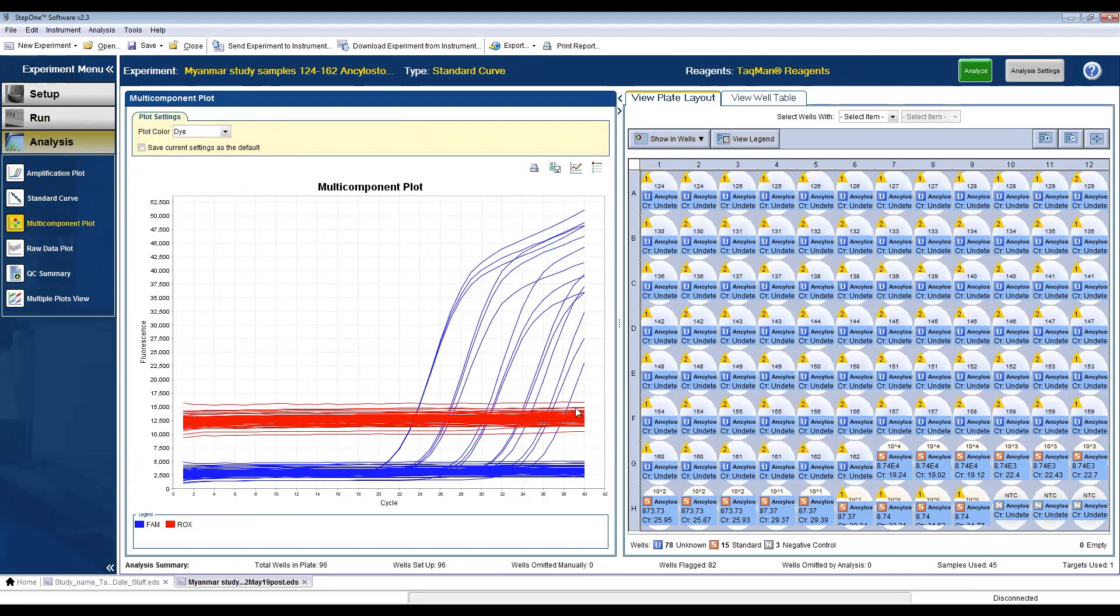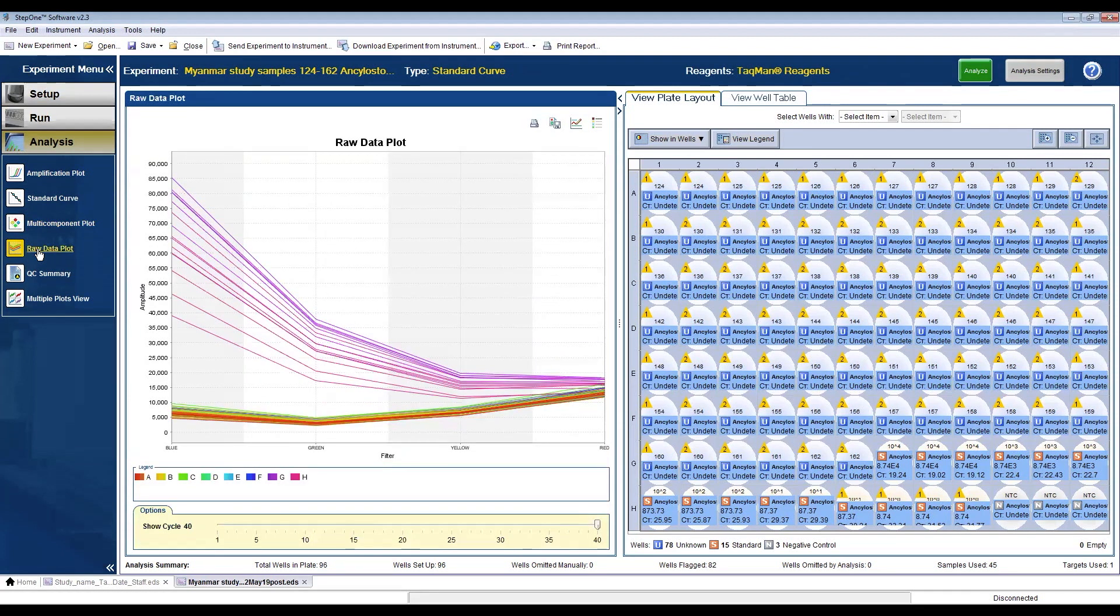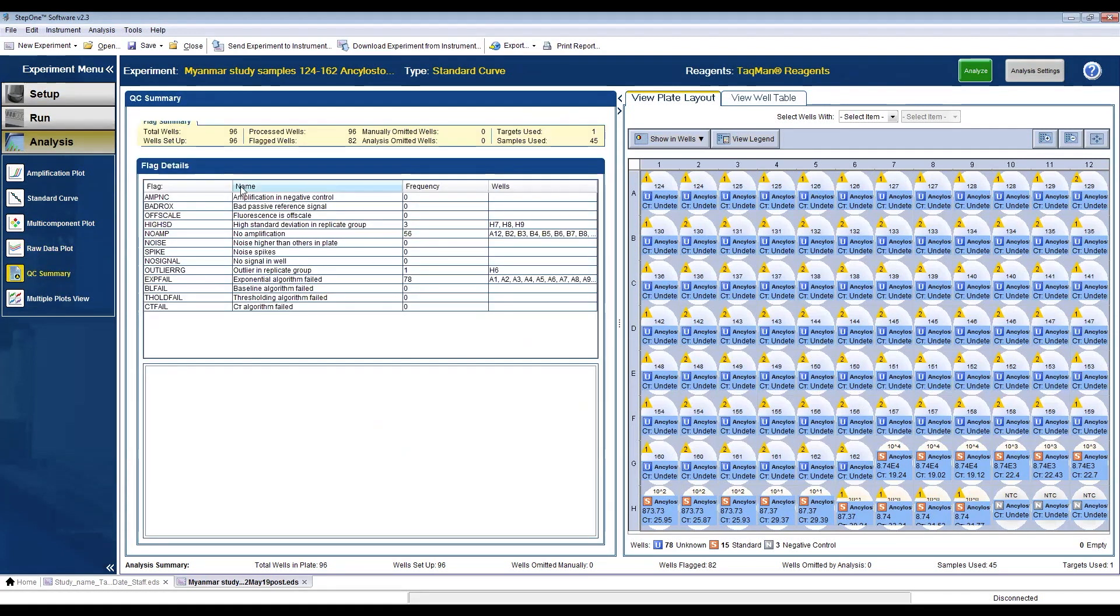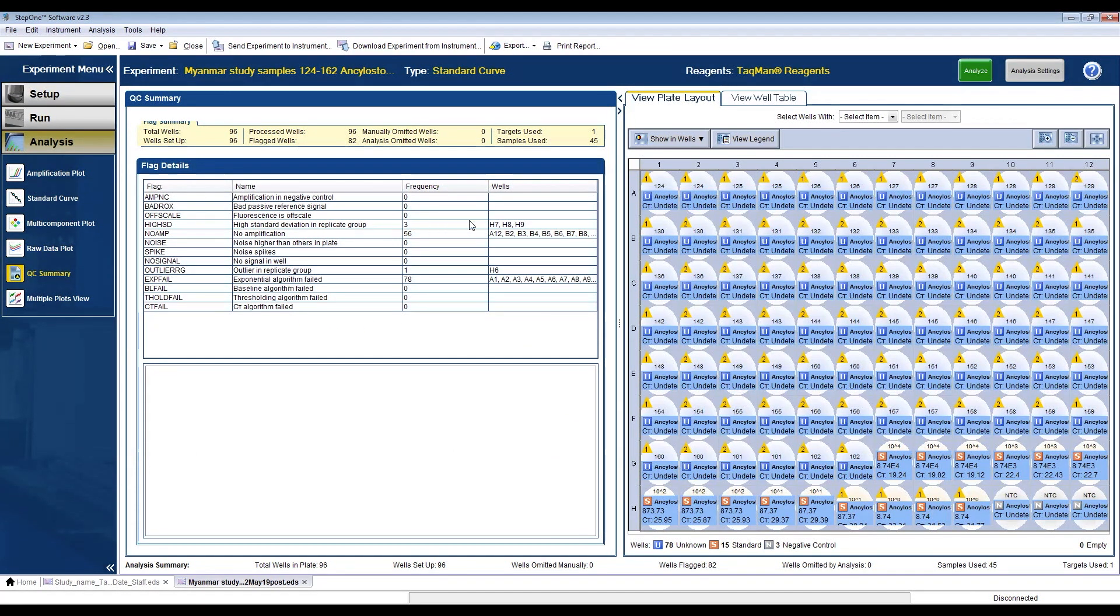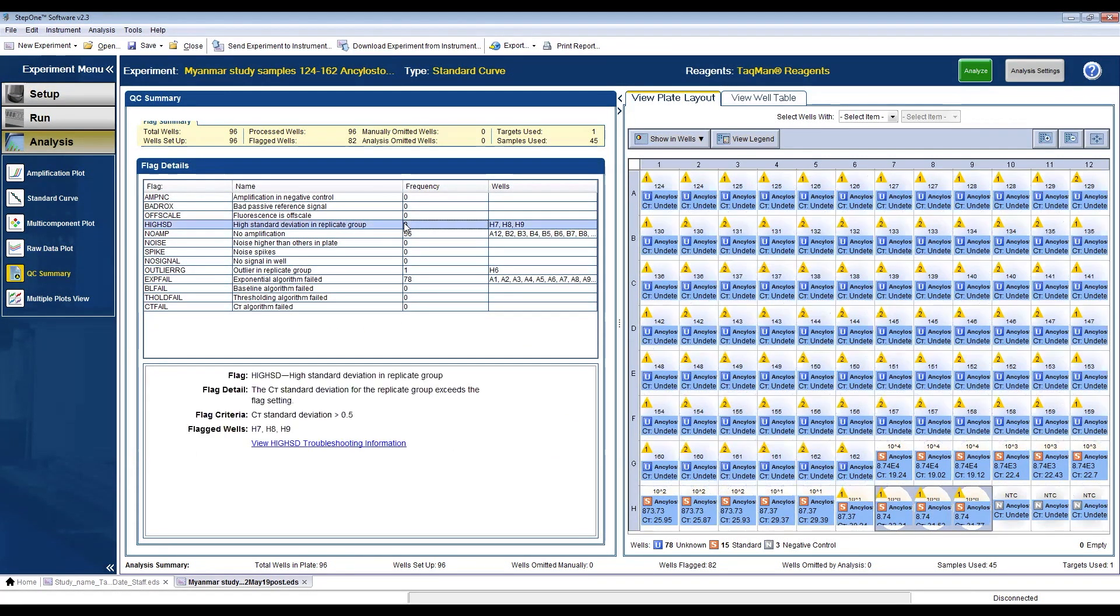In the multi-component plot, the passive dye should stay fairly steady throughout the cycling protocol. The QC summary will give you any informative flags related to lack of amplification or amplification in the negative controls, deviation between replicates, or any issues with the passive dye, to name a few.